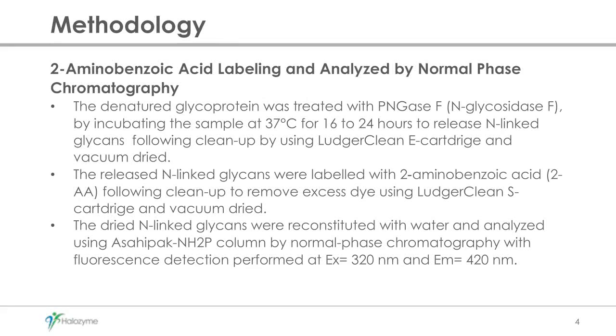Okay, so I am going to jump into the 2AA method that we currently perform. We still perform it because we're in the process of transferring for release. For characterization we intend to continue to use some of our historical methods, but for release we're in the process of moving to a more simplified method for some of our products, and for our new products as well.